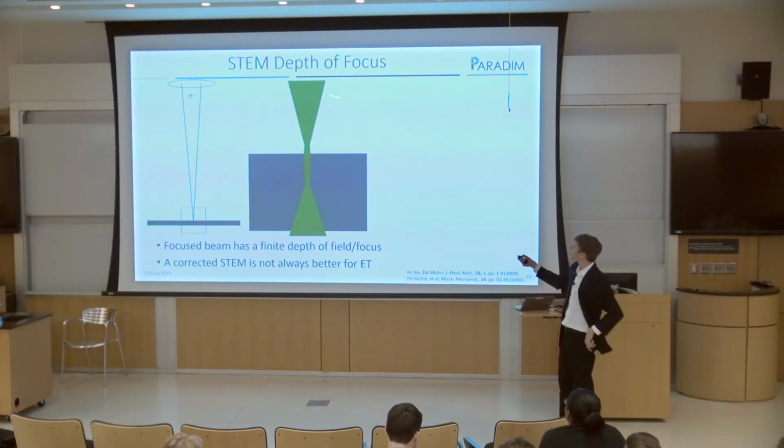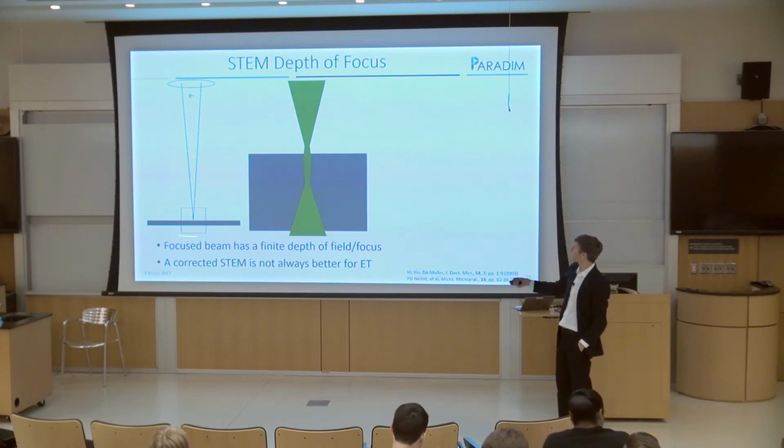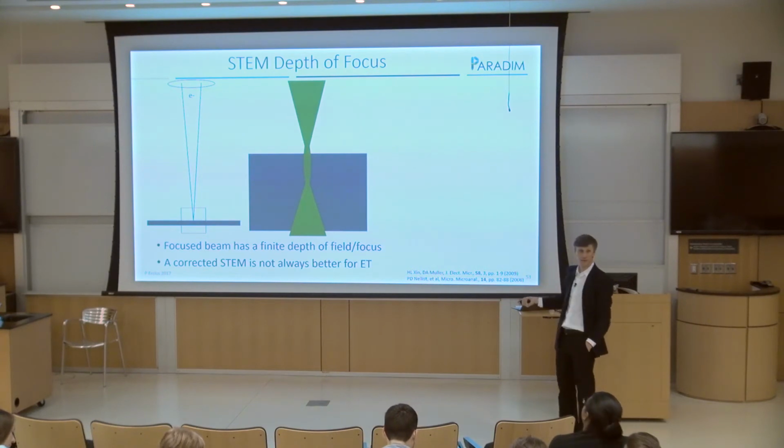Okay, we also have a problem of STEM depth of focus. So although you might look at this and say, my whole thing's going to be in focus, this is actually what the depth of focus looks like if you have a fairly thick sample. Okay?